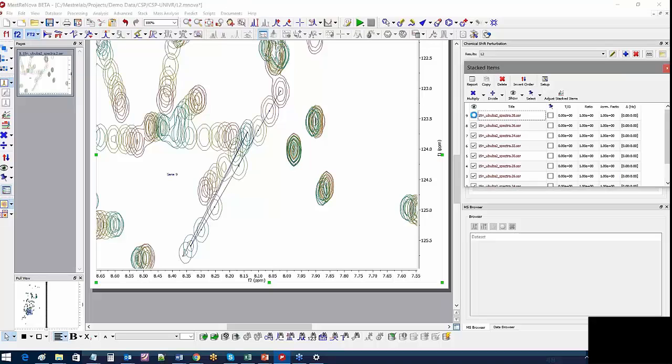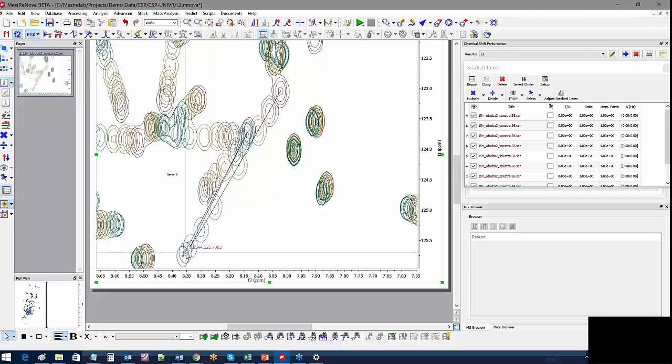Yeah, so that's the last one. And there's still one in the middle. That one should come to here. Yeah, so now we get a more plausible path of the changes.